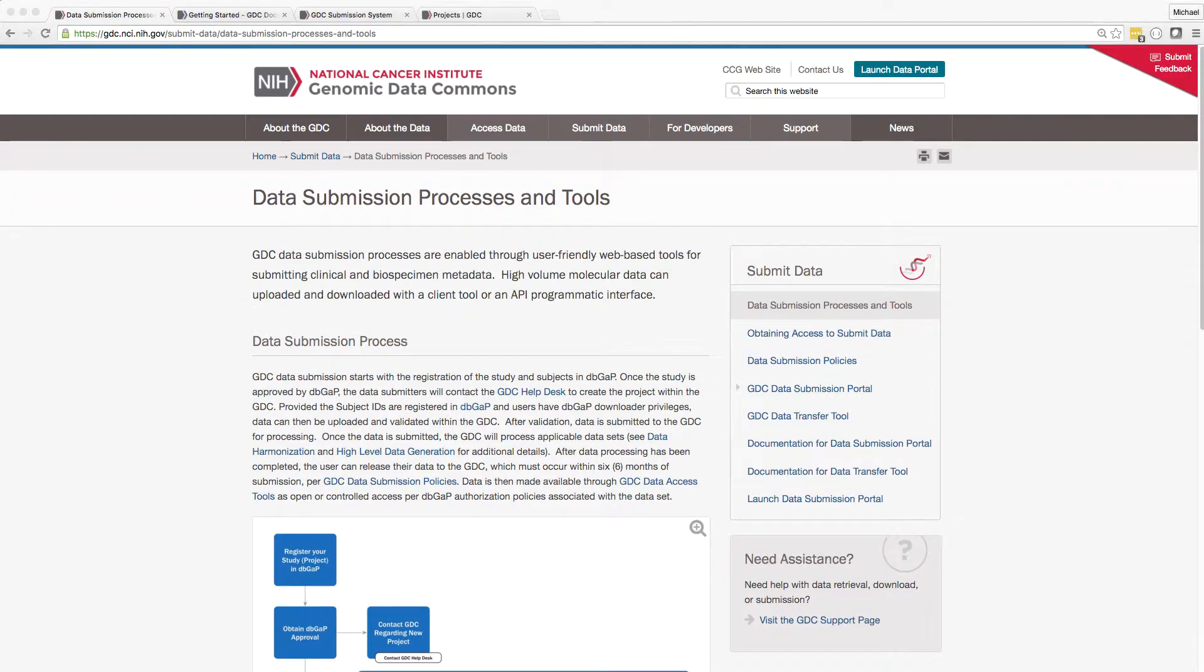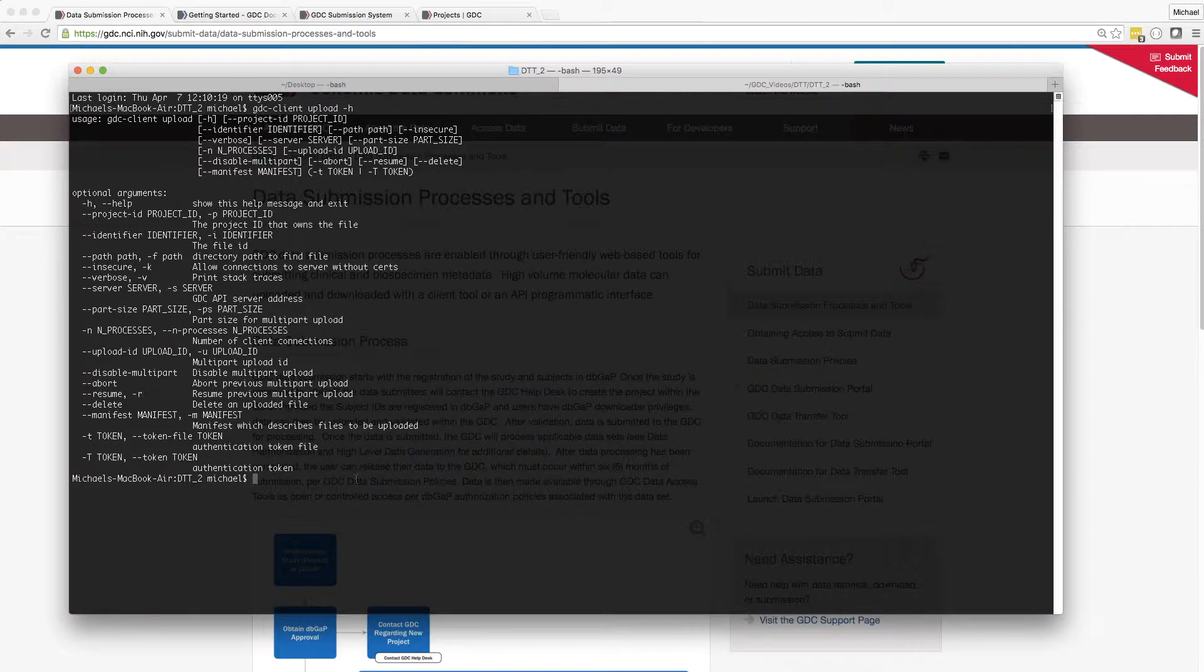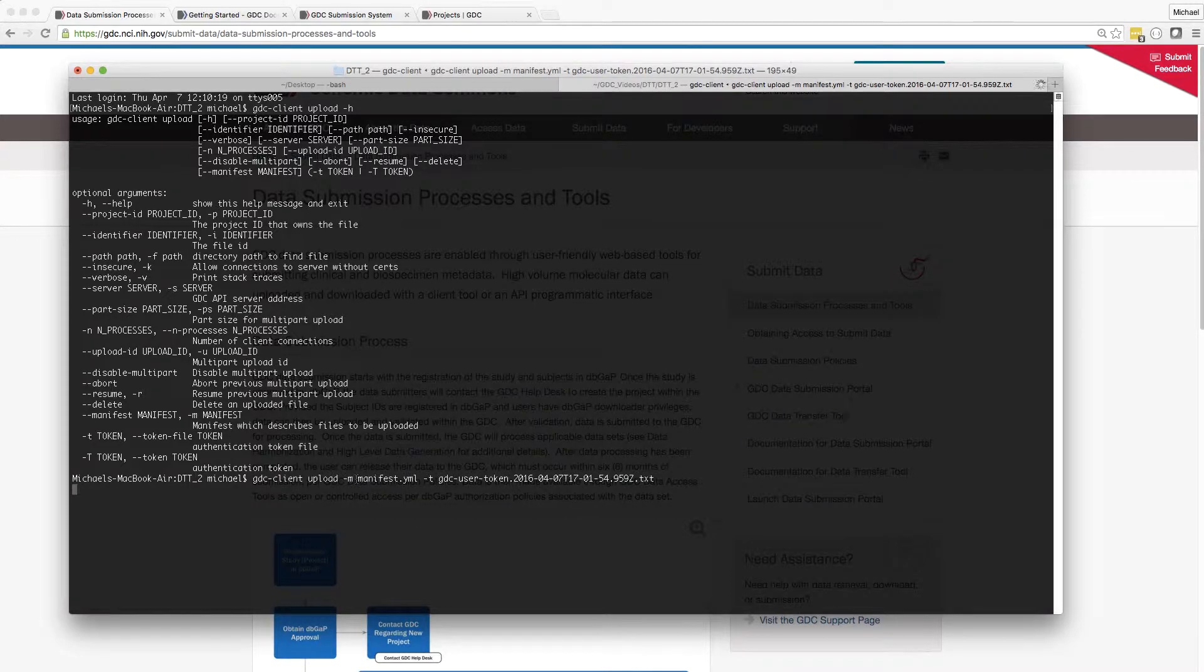In this example, I am providing the manifest with the '-m' option and the token with '-t'.